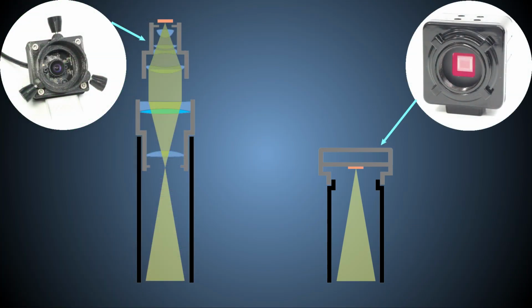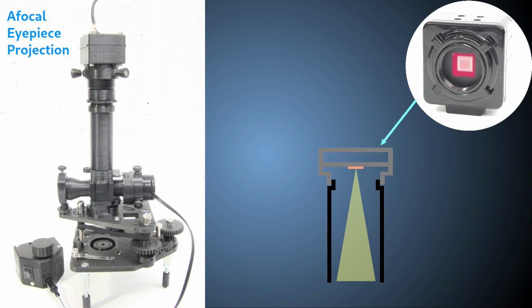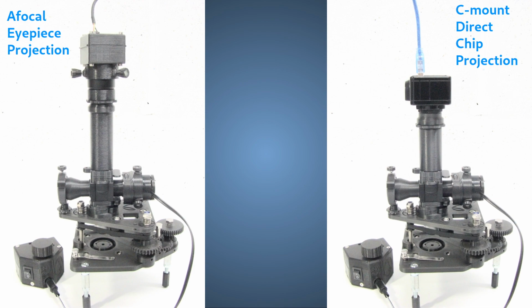Both cameras used in these experiments are inexpensive generic cameras that give a compressed image stream. And furthermore, I will be reducing the resolution to fit this 1080p video frame, and compressing it again for video render before YouTube compresses it a third time. So, the pictures you will see are only a poor reflection of the true quality of the optical image of the scope. Nevertheless, they serve to give you a reasonable idea of what you can expect to see.